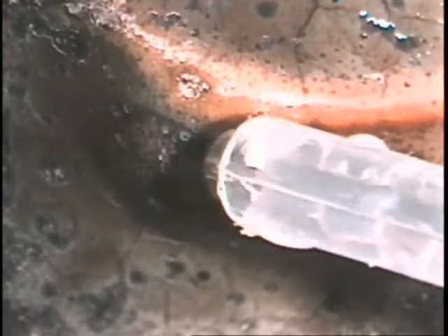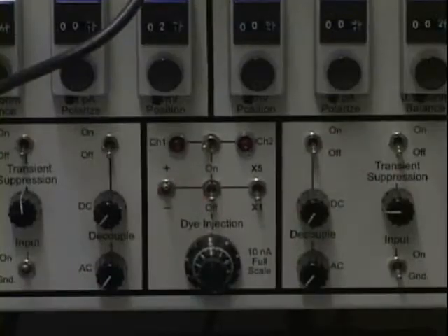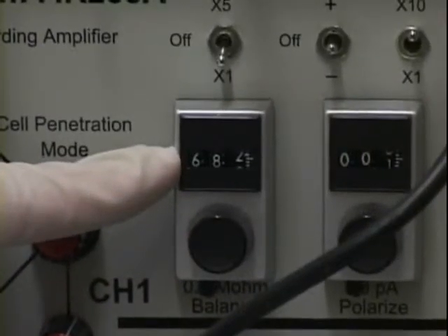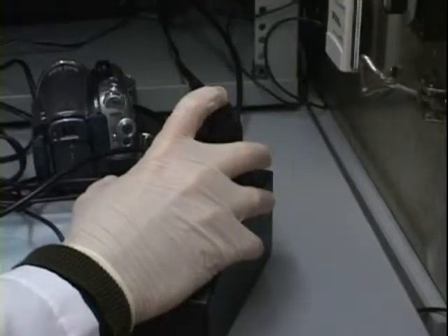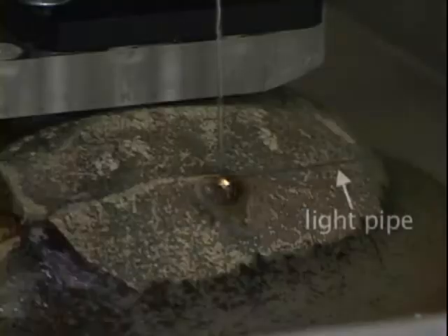A drop of ringer solution is placed on the exposed tissue to prevent drying and the micropipette is advanced towards the retina. When the pipette tip touches the solution, the current injection mode of the intracellular amplifier is engaged and the electrode impedance is measured. Micropipettes with impedances outside the range of 20 to 70 megaohms are discarded. Those in this range are advanced in micron-sized steps into the retina and impaled into cells by vibrating the tip electronically. Light stimuli are delivered to impaled cells with a fiber optic pipe or video display.